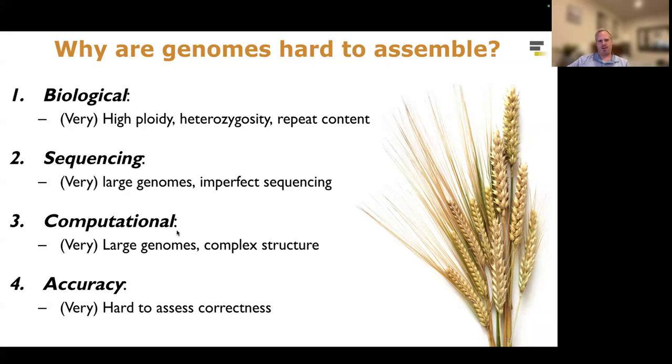And the last thing I wanted to highlight is, to this day, it remains hard to assess the correctness, although there are some new pipelines that are being developed that will help you characterize the accuracy of the sequence that is reconstructed.